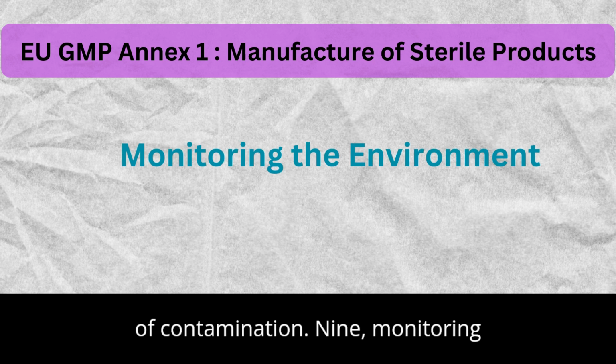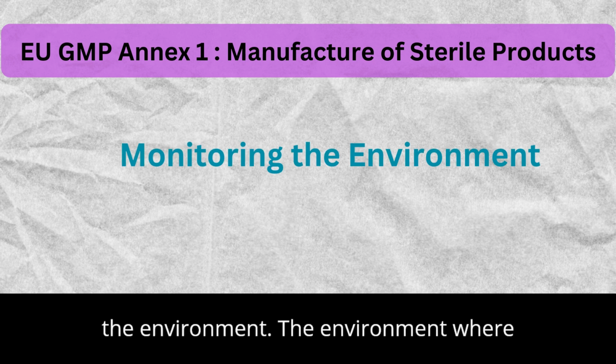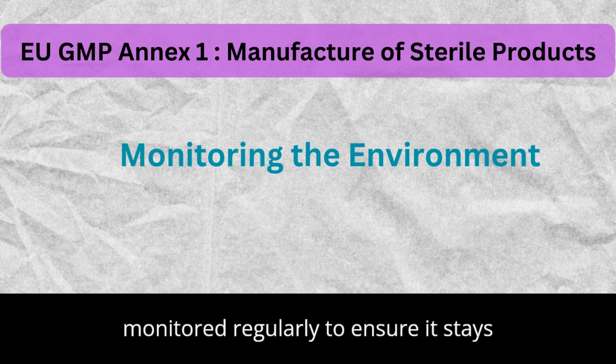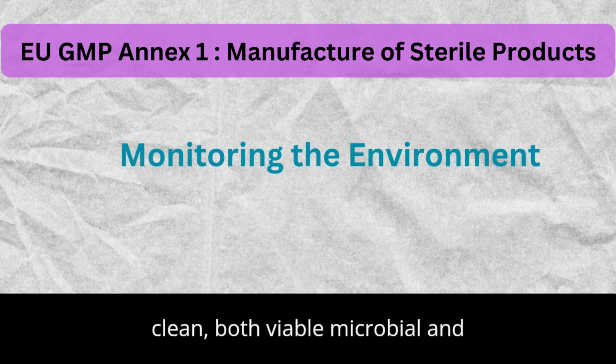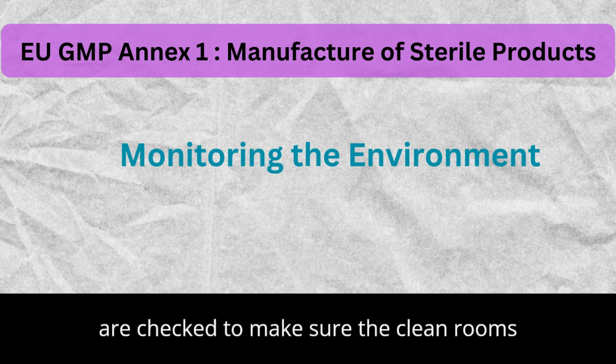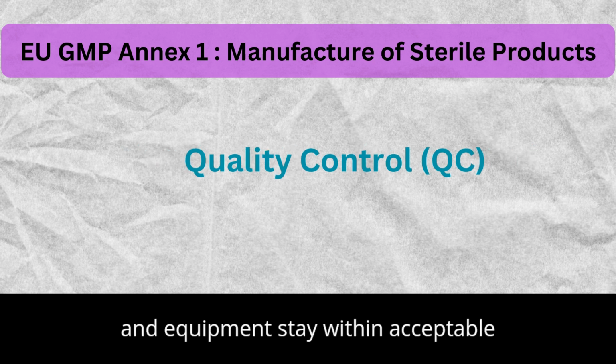9. Monitoring the environment. The environment where sterile products are made must be monitored regularly to ensure it stays clean. Both viable, microbial, and non-viable particle contaminants are checked to make sure the clean rooms and equipment stay within acceptable limits.